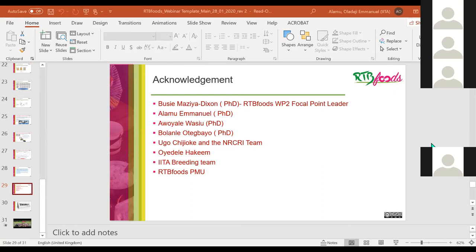But in this laboratory scale, using the standardized method, it has already placed every gari from different varieties at the same level of moisture content. So what we did is to make sure that we use the same quantity of water to prepare the gari, and then it gives us a very good product, so that any variation we see in gari, we address it to the genotype.